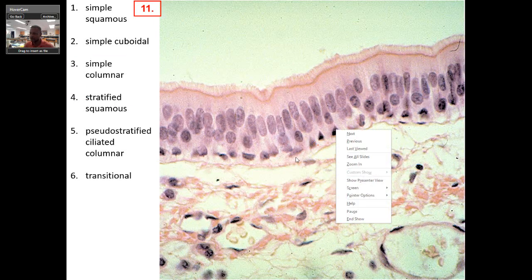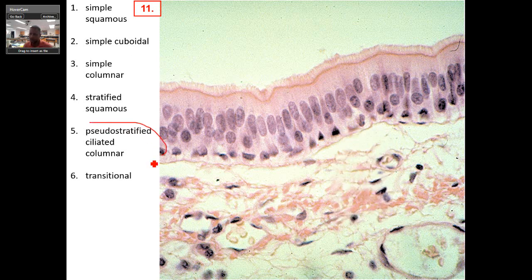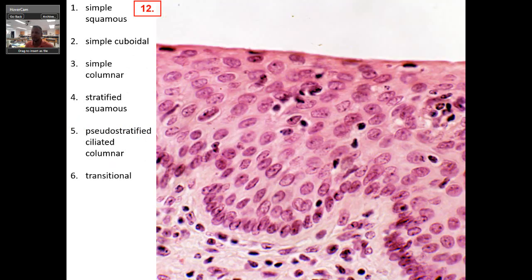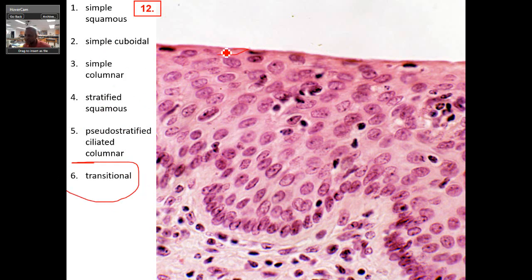A couple more. What is this? There's the cilia. This should be transitional. If this was stratified squamous, you would see these cells flat all the way down until you get to the basement membrane — then you might see some cube shapes — but it would be flat all the way down to the connective tissue.